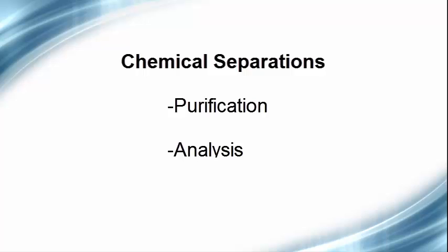So, for this reason, being able to perform a chemical separation is very useful because we can take a complex mixture and break it down into its principal components and then measure spectroscopic data.